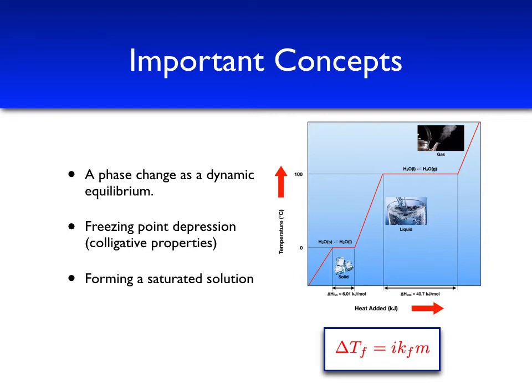These two criteria, looking for the presence of both the solid and liquid phase and looking for no change in temperature, are both what we'll be looking for when determining when our solutions or our pure water are at their freezing points.